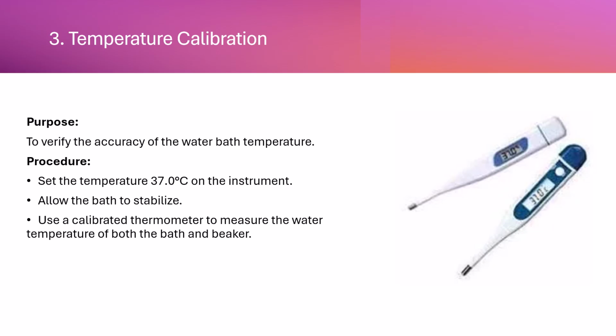So in the entire water bath you can take multiple readings, and from the beaker of the disintegration tester where your stroke length will be commenced, right? So for each point you need to take the temperature reading, right?